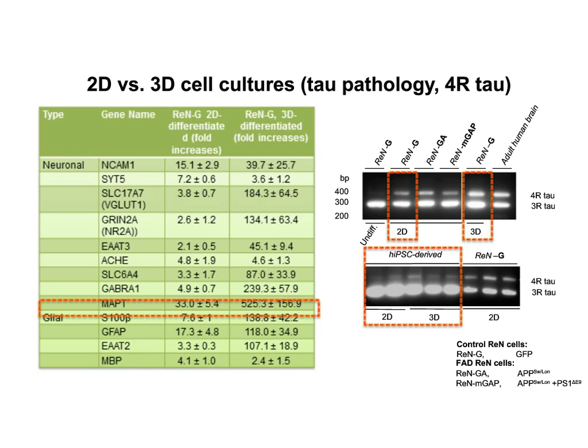So that's one of the concerns I have about recapitulating tau pathways in iPSC-derived neurons, because the 4-repeat tau isoform levels are very low. It looks like in the 3D culture condition with these cells, we can actually achieve high levels of 4-repeat tau.